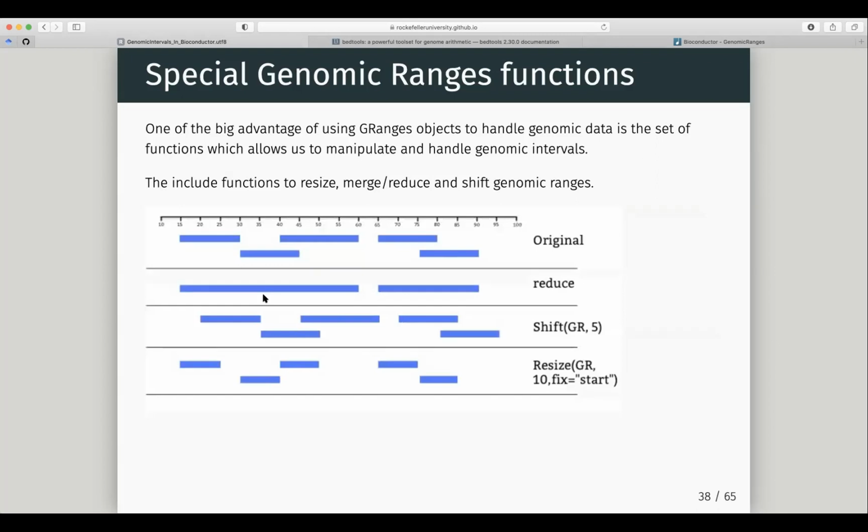So that's the first half of this talk done: how we can create GRanges, and how we can manipulate these once we have them inside our GRanges object. But like I said at the beginning, this is only really half the battle. Why not just store all my GRanges in a data frame? Much easier for me to access. Sure, I'm limited by some things which protect me in GRanges, like I can't make my start past my end, and I can't put in unknown strange strand information, but really there's no advantage over a data frame yet.